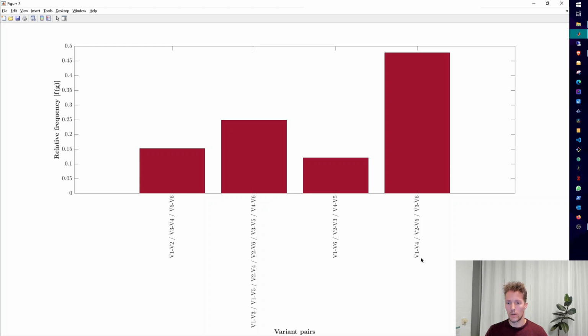But what we can see is that we have mostly variant 1 to variant 4 pairing, and that the pairing between those 2 variants by the misorientation of the grain boundaries is also equivalent to 2,5 and 3,6 pairing. That's also what we saw in the histogram earlier. So this is one characteristic grain boundary misorientation that's prominent in our microstructure, and it's way more prominent than the remaining characteristic boundaries. So this is again quite characteristic of lath martensite.